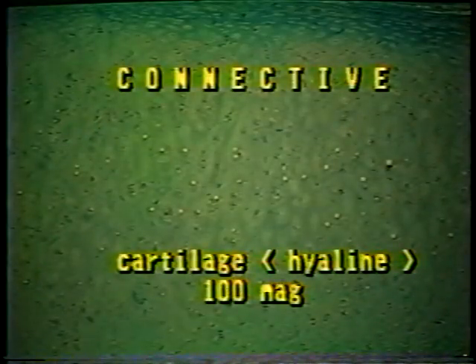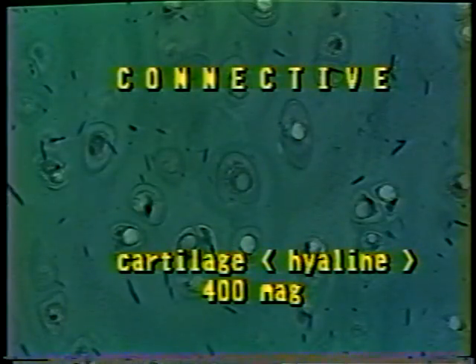Cartilage is composed of cells and a smooth, homogeneous matrix. It varies in flexibility. The cartilage of the ears is elastic and highly flexible. In the nose, it is called hyaline and is flexible, but not so much so as the ear. These types provide support. Pads of cartilage in the spinal column are called discs. Their purpose is to cushion.